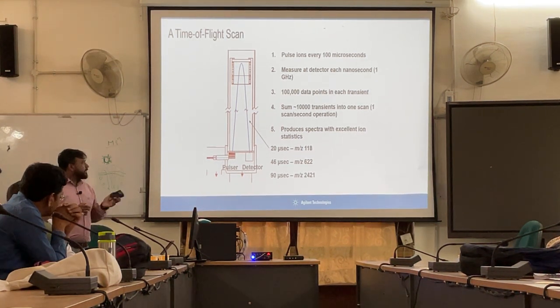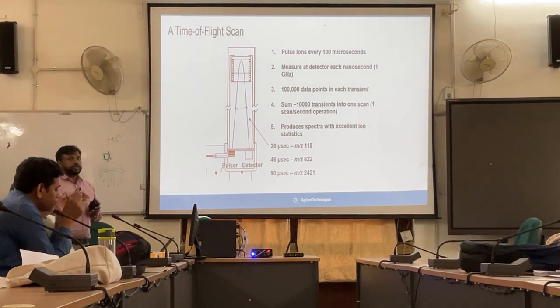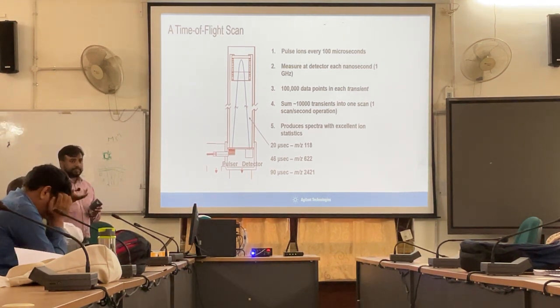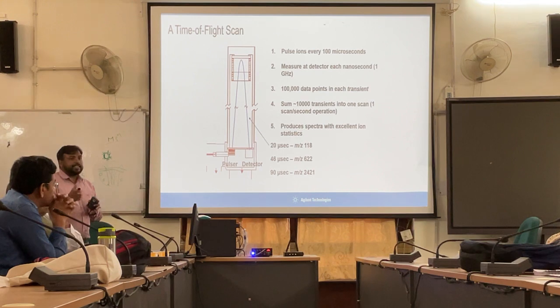So in case there is not any electronic parameter that is going to vary, then we only have to calibrate the TOF tube. In that calibration, we only adjust if there is any drift in the time, so that we can mitigate the time changes happening for the individual masses.